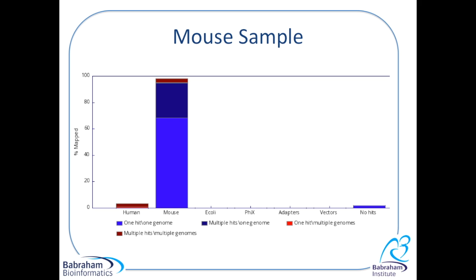However, a small number of reads mapped against the human genome. Does this mean there is contamination? Well, let's just look in a little bit more detail at the graph.